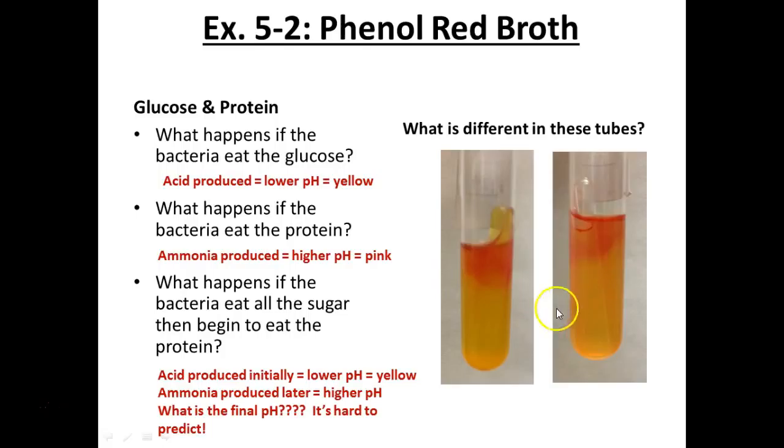Right, one of them has gas. And so the good news about that one, which Jessica has, and which we would code this AG with weak K, where it's starting to eat the protein, is that if this tube went too long, and say it was orange, you would know something happened, right? Because that gas bubble will indicate, well, fermentation must have happened, right?